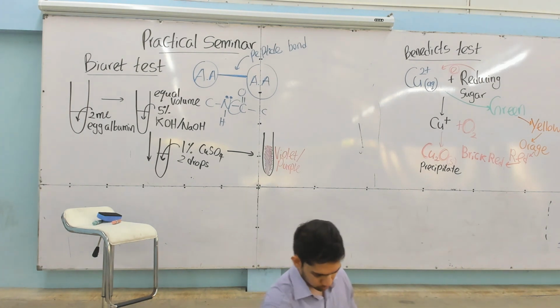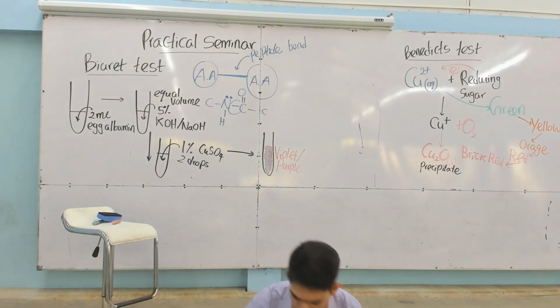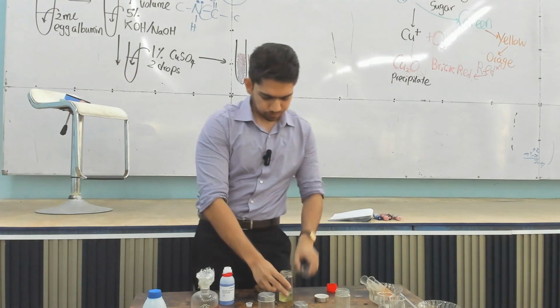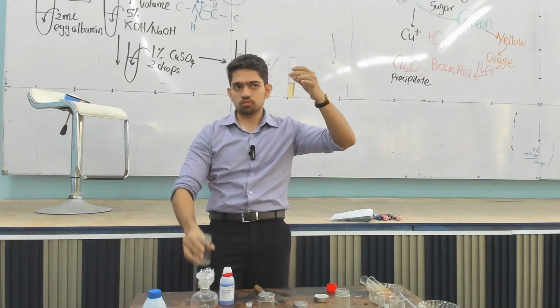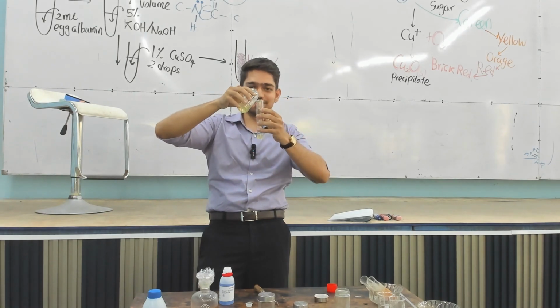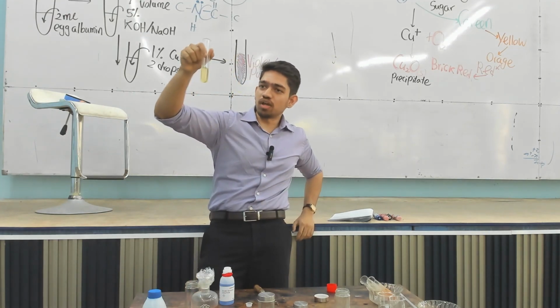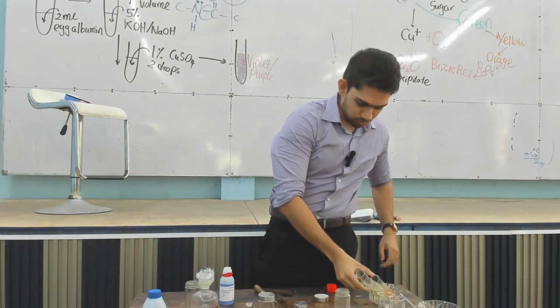So we take a test tube. I think we can directly add it, no issue. We have some egg white, so you add it to a test tube. Because it's a viscous solution, either you have it completely or not, it doesn't matter. It has become a bit of a colloid. The egg white has coagulated a bit. I broke it at around 12 p.m. today.